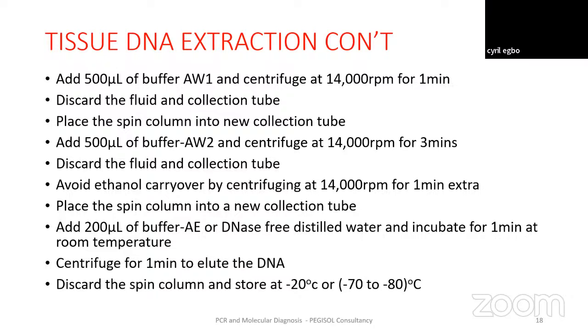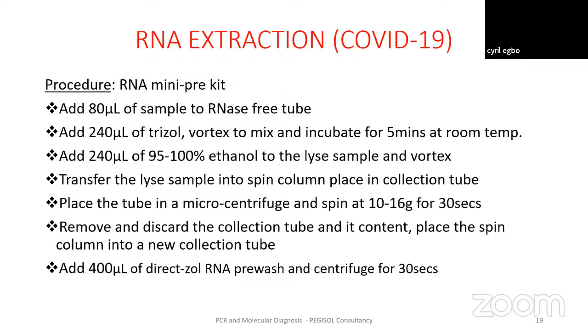Then after which you add your reagent to release the DNA. Then you add your wash buffer for washing and binding, and your elution buffer to elute. It's the same method, the same process.